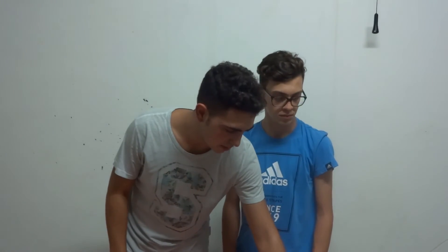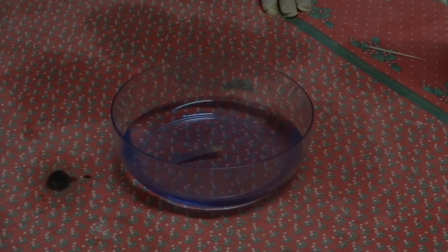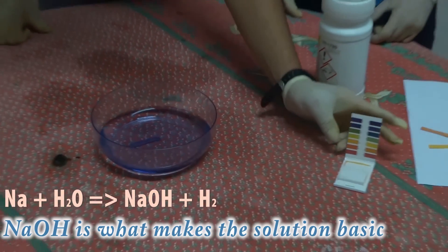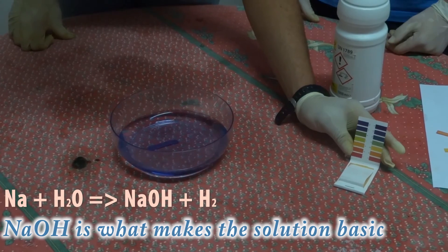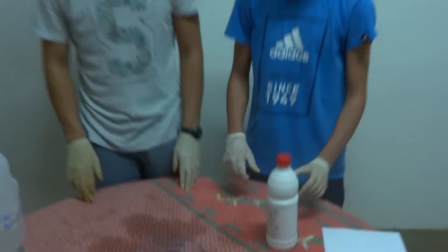Now that the reaction is over, we can test that sodium hydroxide has been produced. As we can see here, the indicator paper turns to a color that indicates, as the scale says, that the solution is not neutral anymore but is basic.